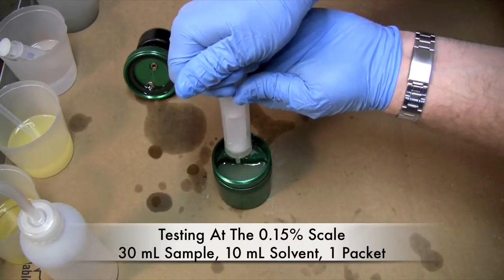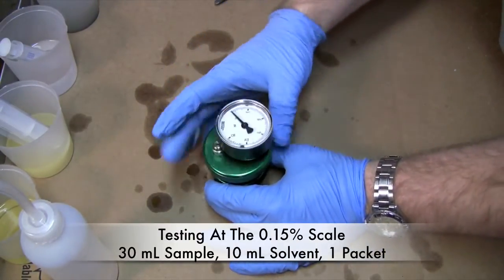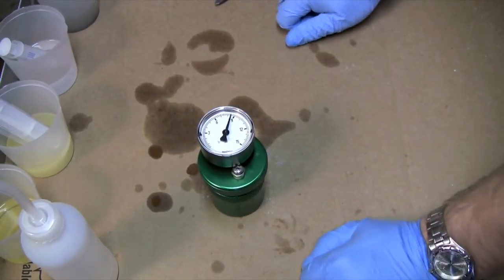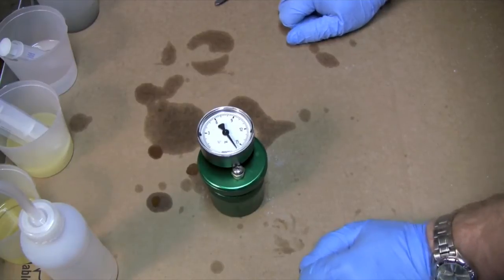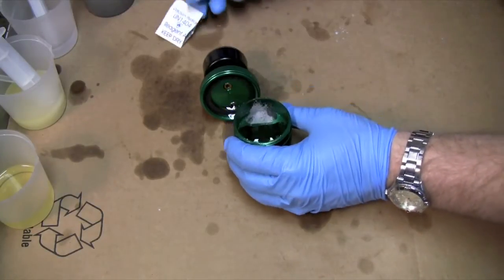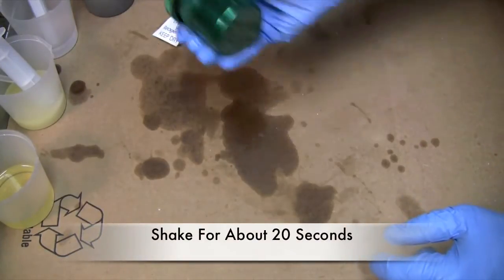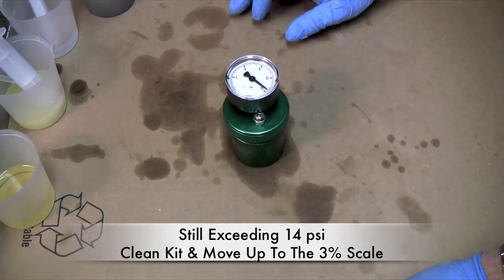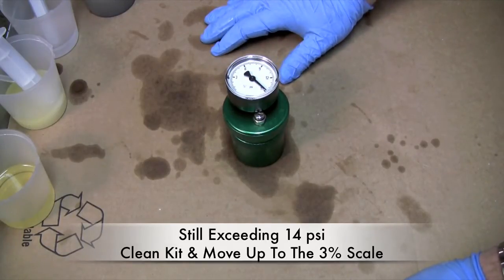I'm using the lowest scale that comes with the kit. We're going to put our lid on and shake it a little bit. As you can see, my meter is just climbing like crazy. They say if we go all the way to the top, like this is going, then we need to move to the next scale. Our test instructions tell us that if this exceeds 14 to stop and move to the next increment — it has, so we're going to move out of the 1.5% range and into the 3% range. It's obvious that this sample has an awful lot of water content in it.